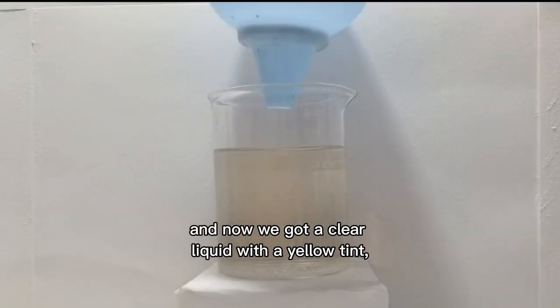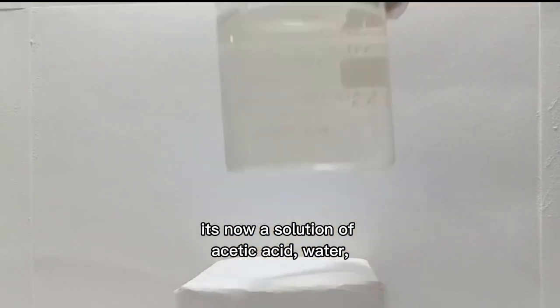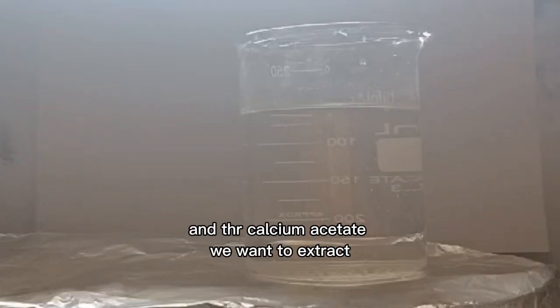Now we have a clear liquid with a yellow tint. It's a solution of acetic acid, water, and the calcium acetate we want to extract.